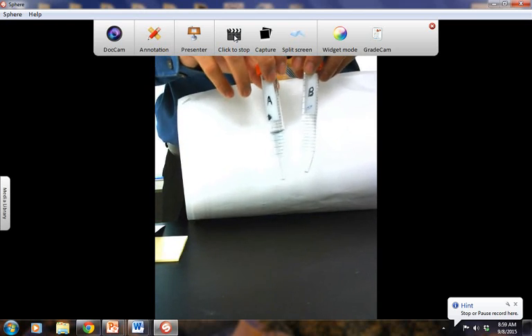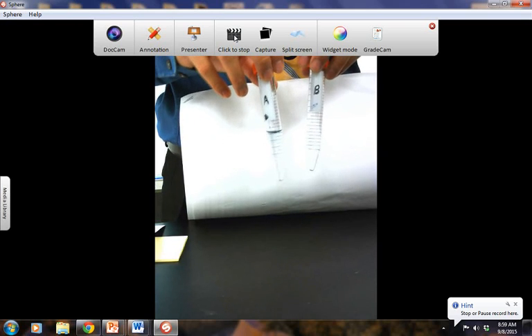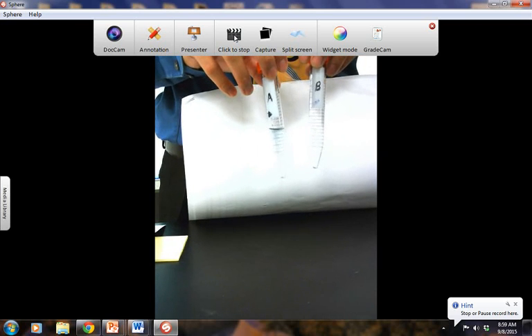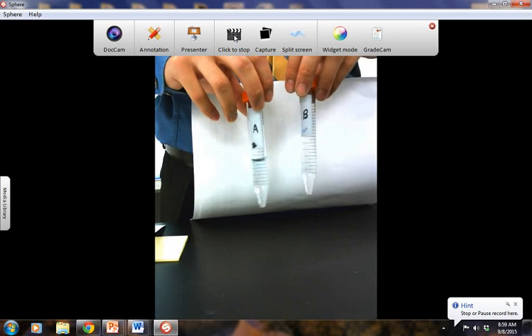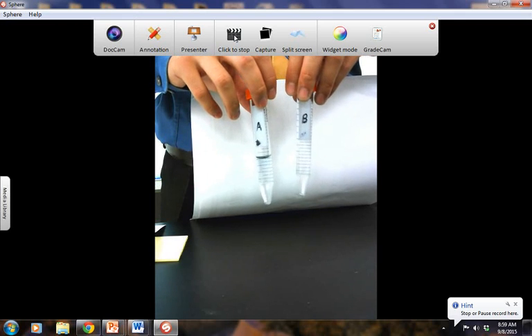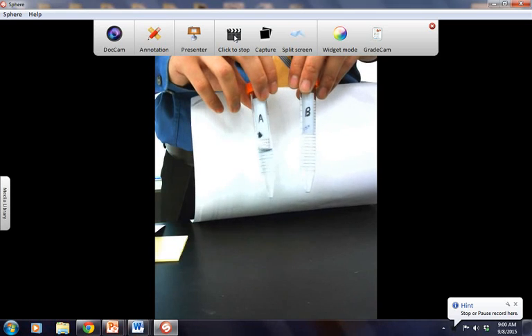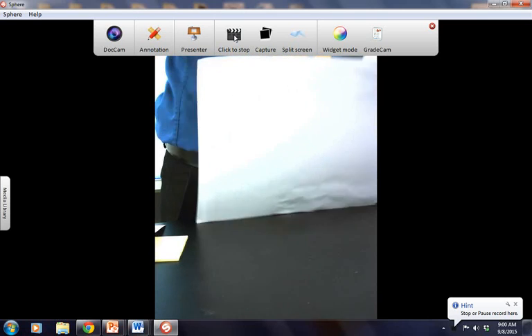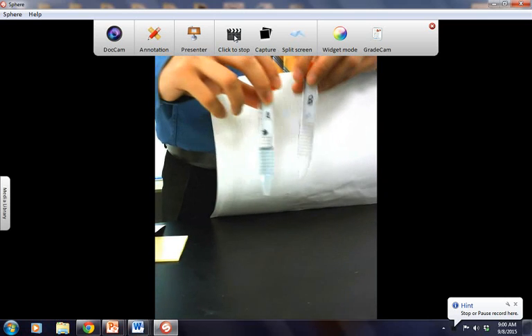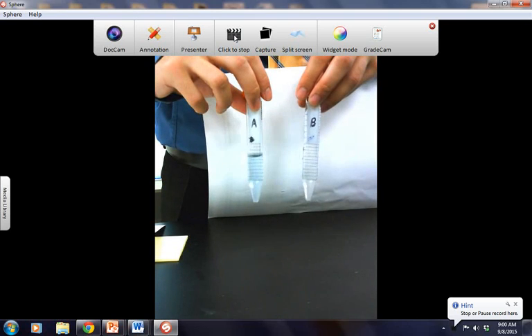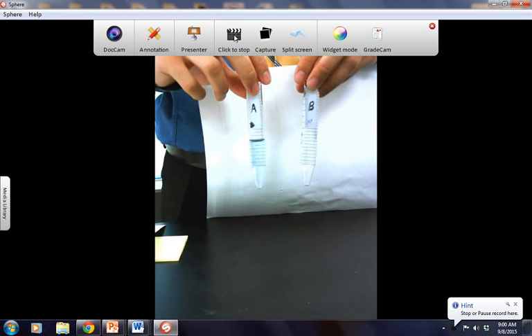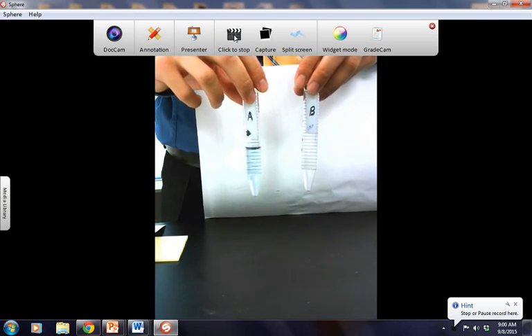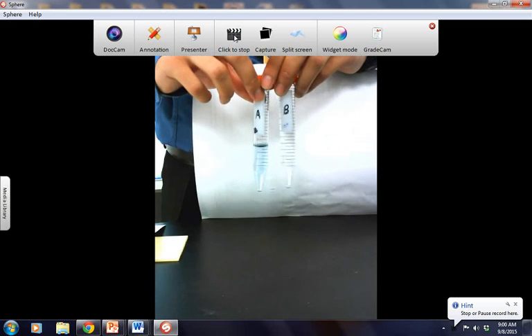Experimentation. For this experiment, we're going to go ahead and give one hard shake for each tube, and then I'm going to show you what they look like. It's during this time I want you to write down any similarities or differences you see between the liquids. Right now, before any experimentation, they're actually looking the same, even if A looks a little bit different. Here we go — one hard shake. Take a look, make an observation, write down similarities and differences. You can pause it here if you need some more time.